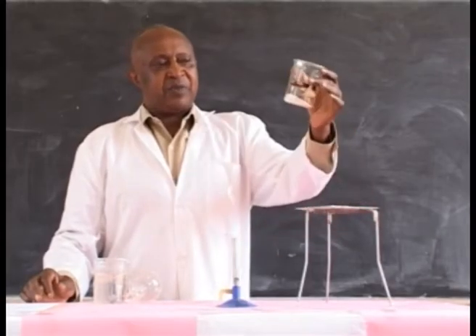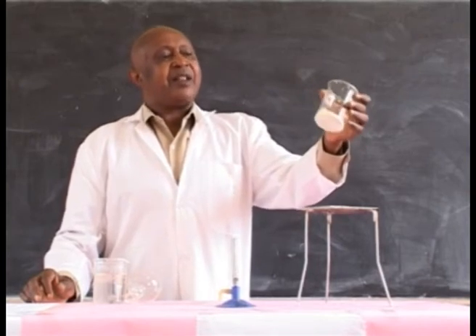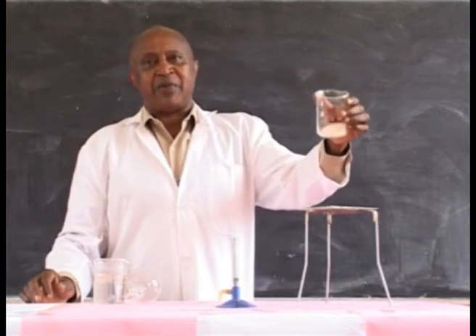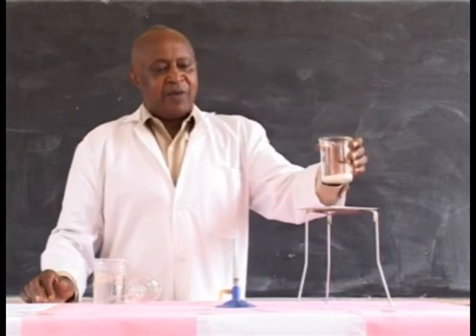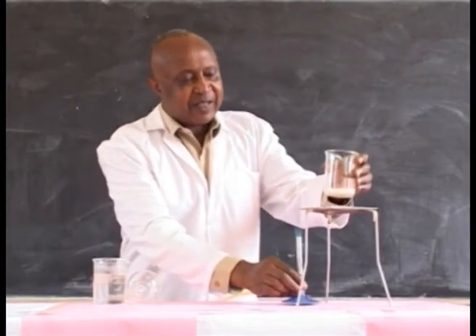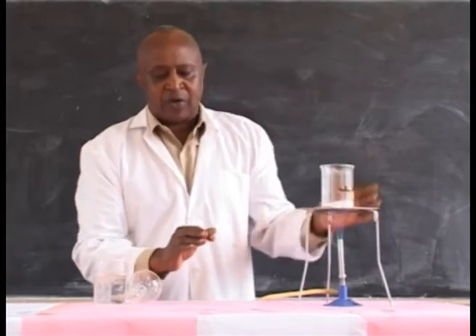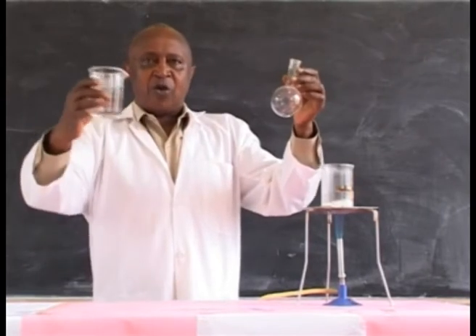If you heat this mixture of iodine and table salt very strongly, the iodine will decompose or will melt and form a liquid, and the process won't succeed. Then we have to heat very gently, making sure that the asbestos is preventing strong heating. And then cool the vapors by cold water.